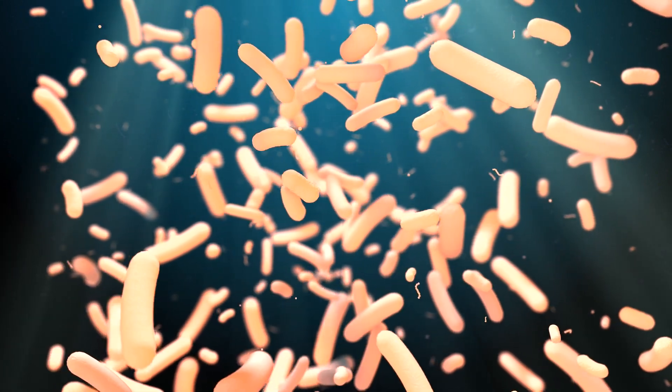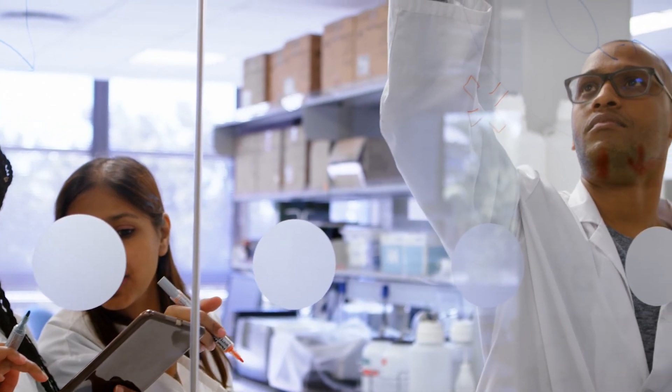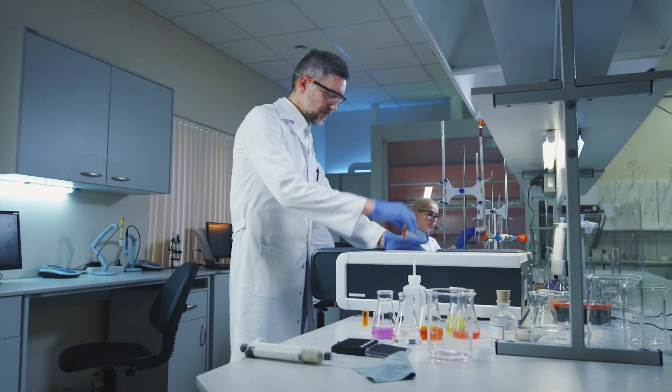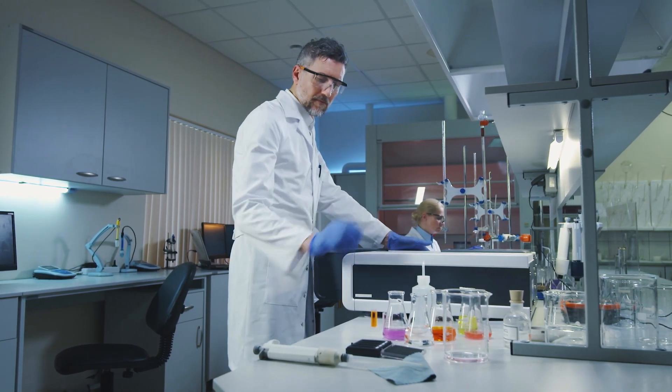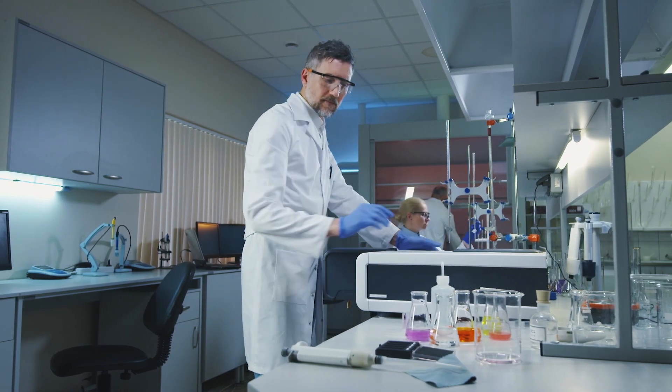The configuration of the model was developed in conjunction with key industry partners like AstraZeneca, Janssen R&D and others. In 2019 we published in Science and Translational Medicine how the liver chip was able to reproduce the toxicity of certain compounds as they were exhibited in humans.